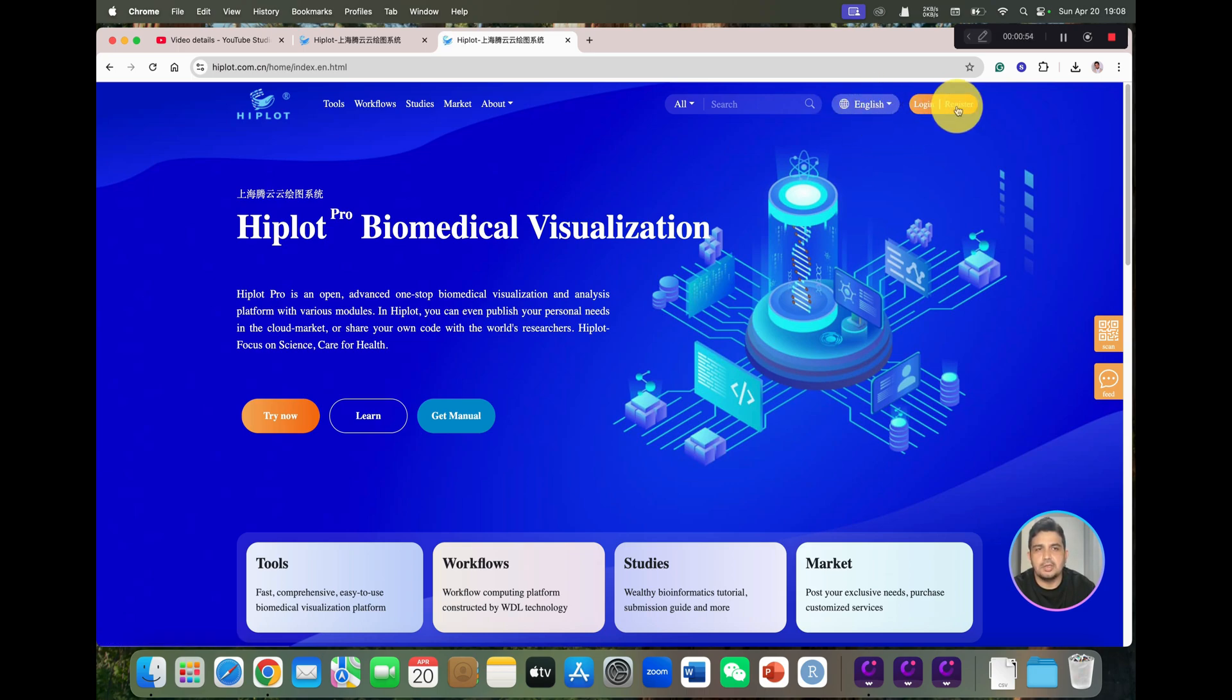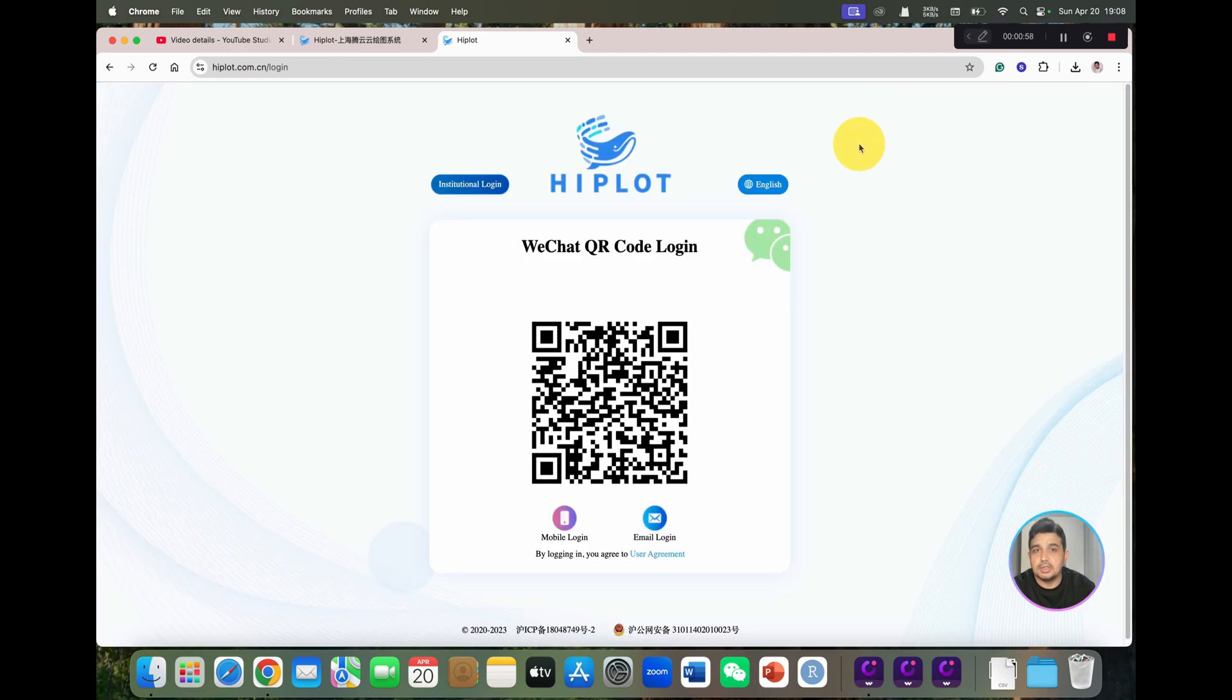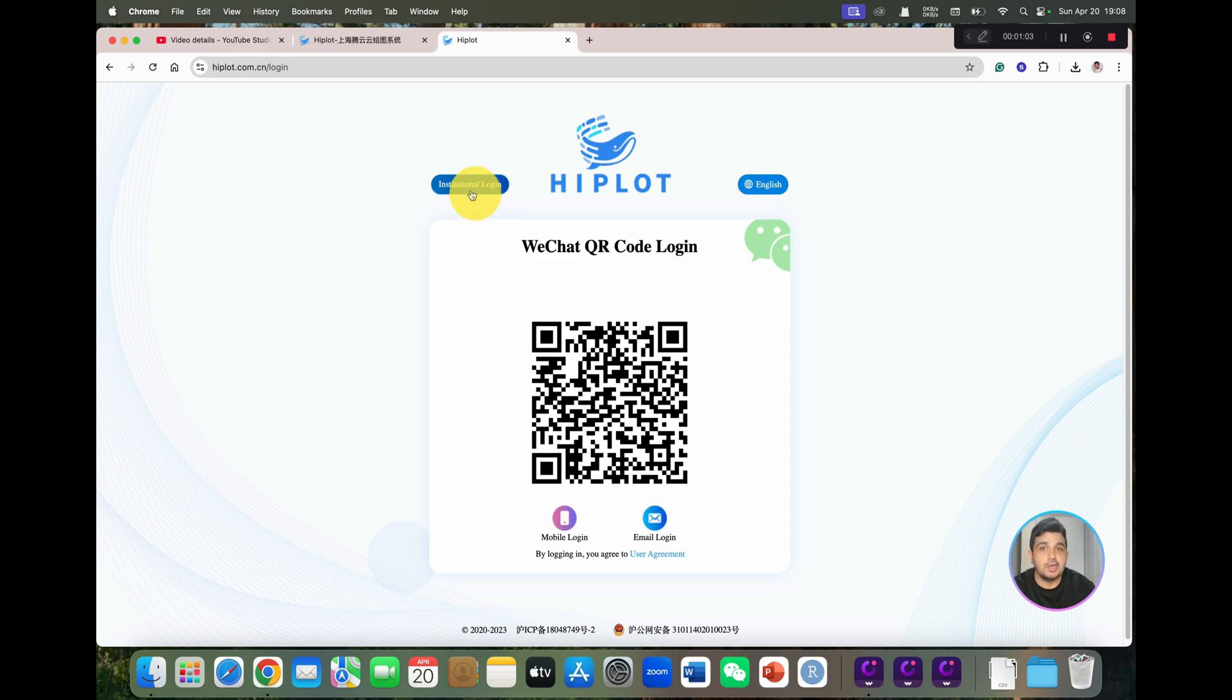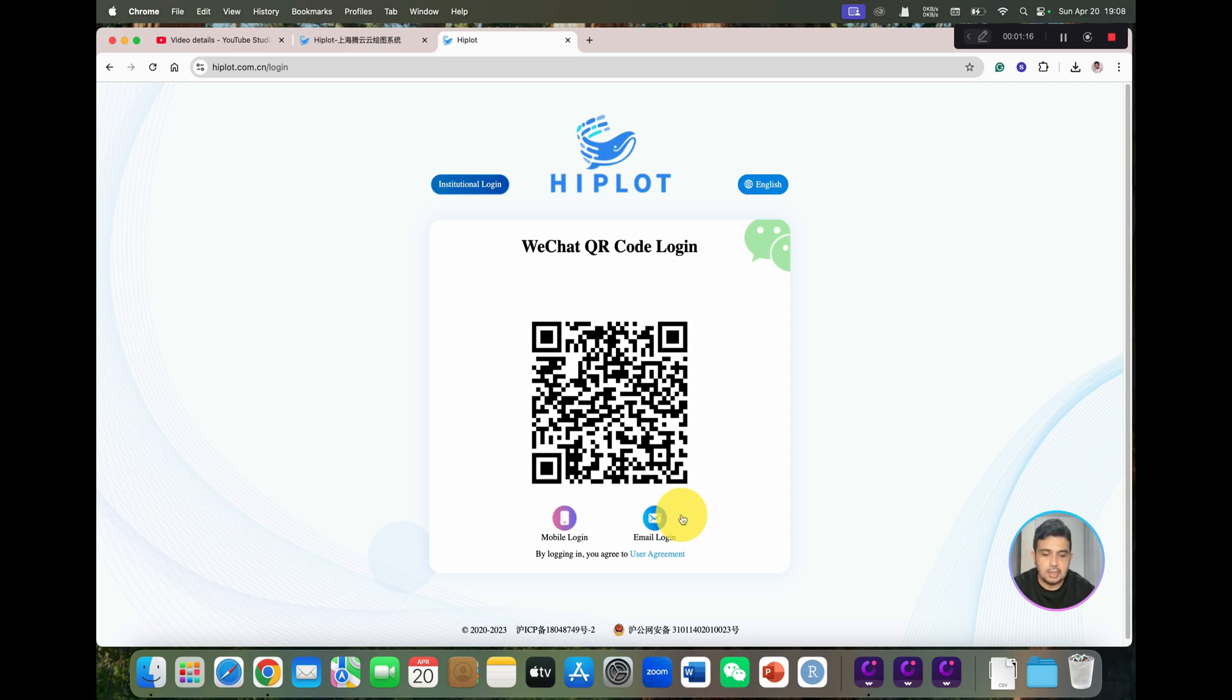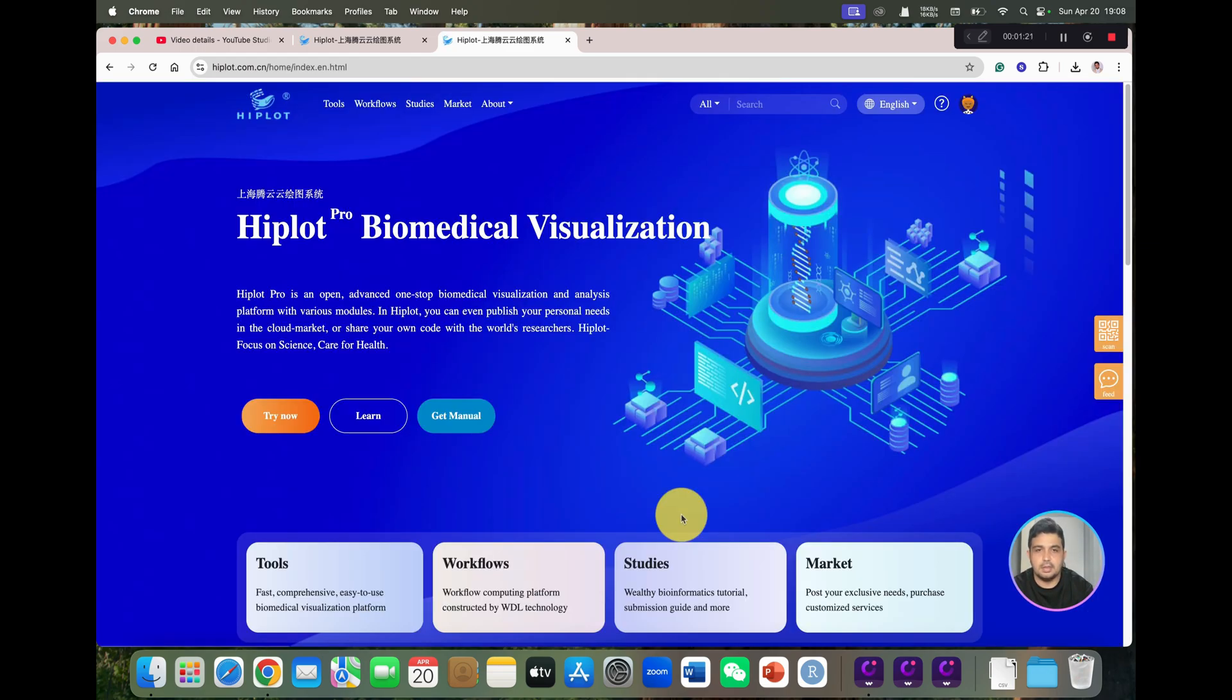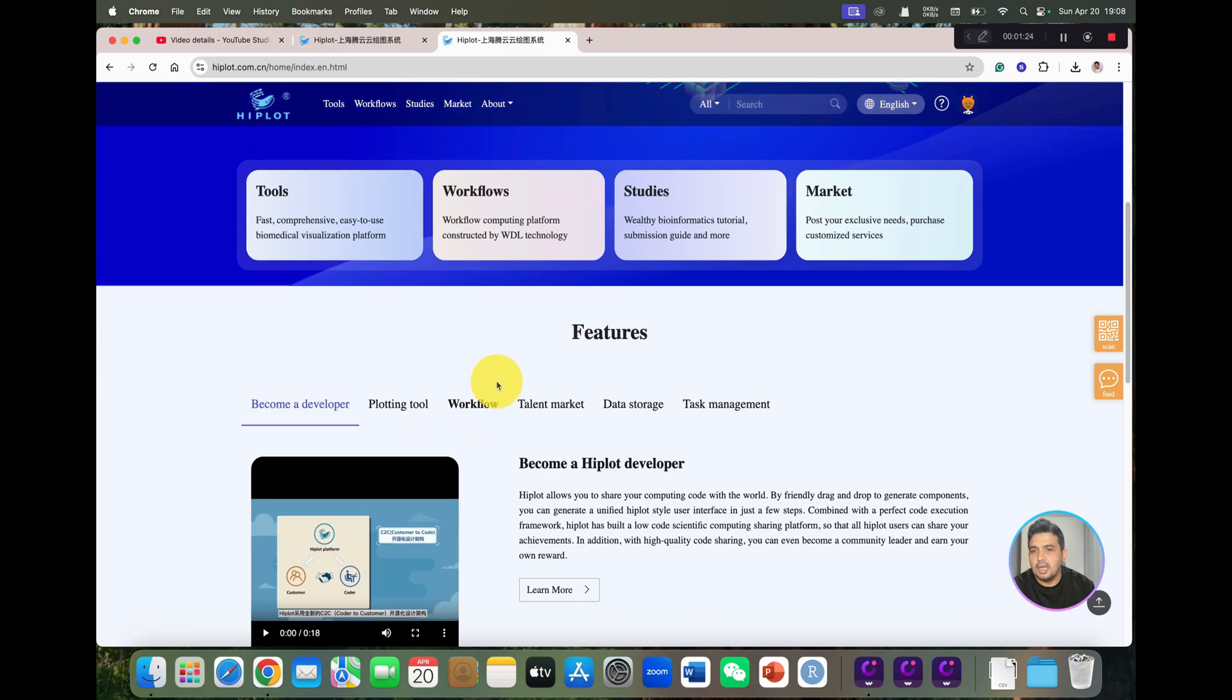You can go to register if you are a new user. You can see it will give you several options for institutional login, mobile login, and email login. As I have already created my login, I can directly sign in through WeChat. So let's sign in. You can see now I have signed in.